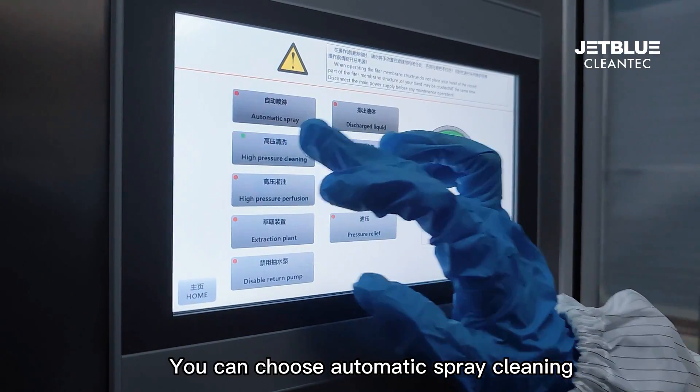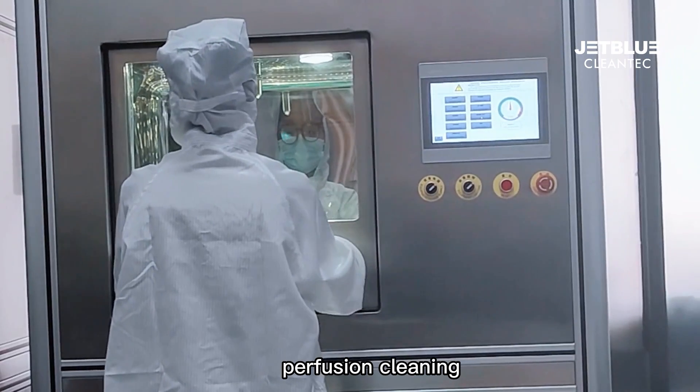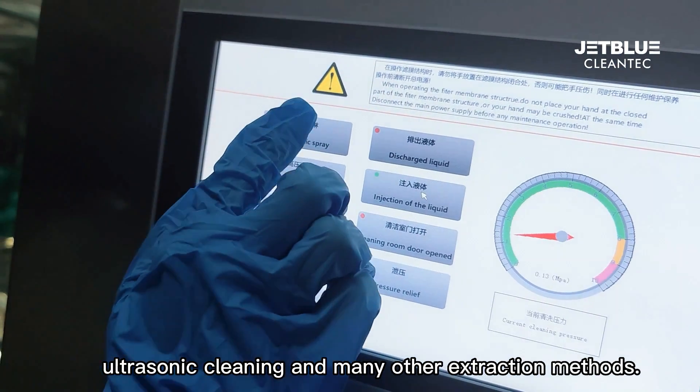You can choose automatic spray cleaning, manual high-pressure flushing, perfusion cleaning, ultrasonic cleaning, and many other extraction methods.